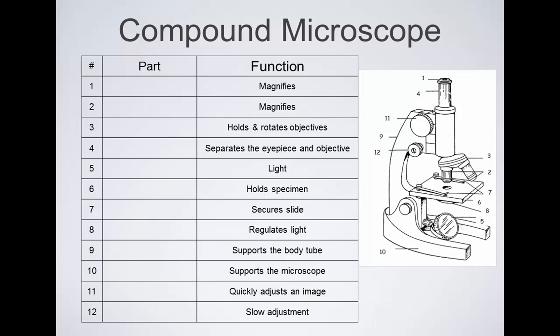All right, so if this is our microscope, when we look at an object that's on the stage, the object gets magnified by two different lenses. What's the first lens? As light's coming from our light source through here, what's the first lens that will magnify the image? Where is it located on here? Anthony? The one like in the middle.